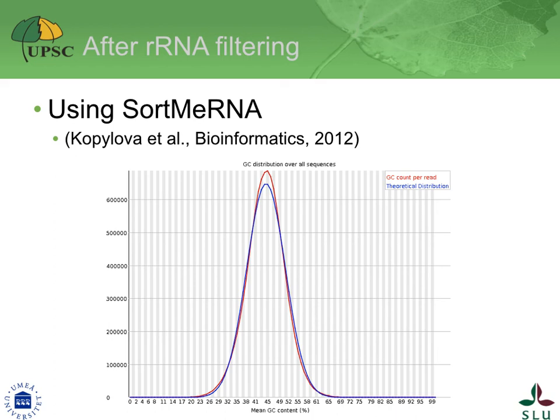As you can see from the GC% distribution, it now almost perfectly matches the theoretical distribution. Based on this whole process, it now appears that we have corrected for the bias observed in a meaningful way, and have reads that are now clean.